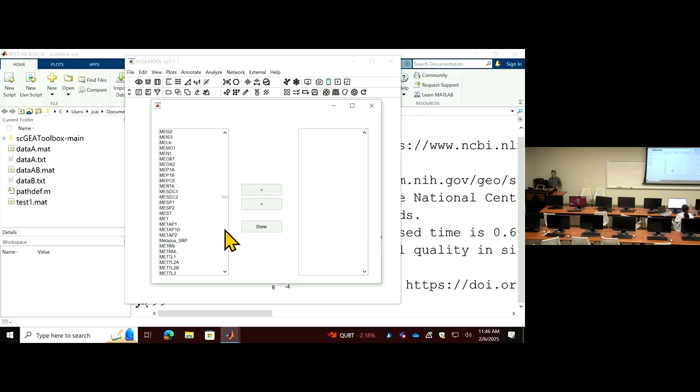So you have the option in this step to exclude them from analysis. So you see all this. What are they? They're ribosome protein genes, also different isoforms maybe.